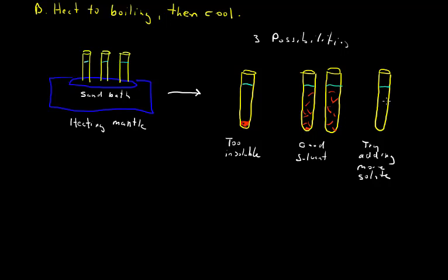If you don't, that's an indication that you had too much solvent, and you can redo this by adding a little bit more solute. That is, you never really reach saturation. The solution wasn't really saturated. So add more solute, reheat it, and then allow it to cool, and watch for crystallization.